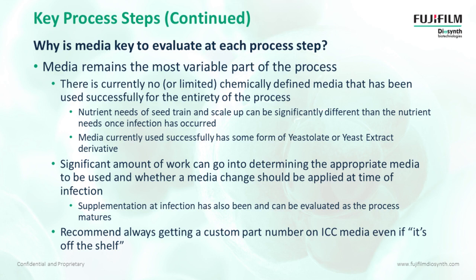And again, to highlight why the media still remains the most variable part of a lot of these processes, that chemically defined media, we're really trying to partner with some of our media vendors. Irvine specifically, since that's one of our sister sites, we're really working with them to see how close to a fully chemically defined media we can get. And that just helps us to be able to have a more predictable and more robust process for the entire life cycle of the project.